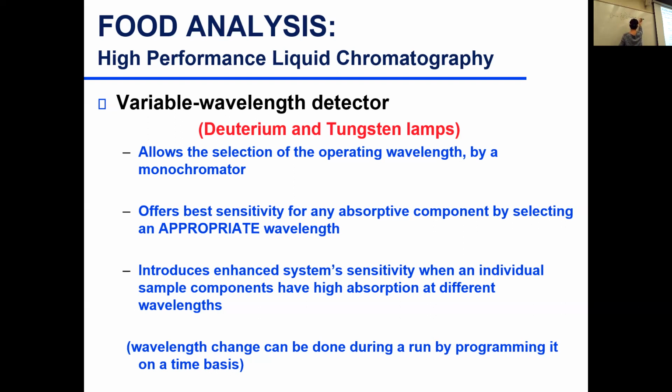Going in, usually you have a flow cell where your sample goes in, and then this one particular wavelength hits the sample, the sample absorbs light, and then the transmitted light gets detected and converted to absorption. So this monochromator selects that light, and you measure absorption at that particular wavelength.